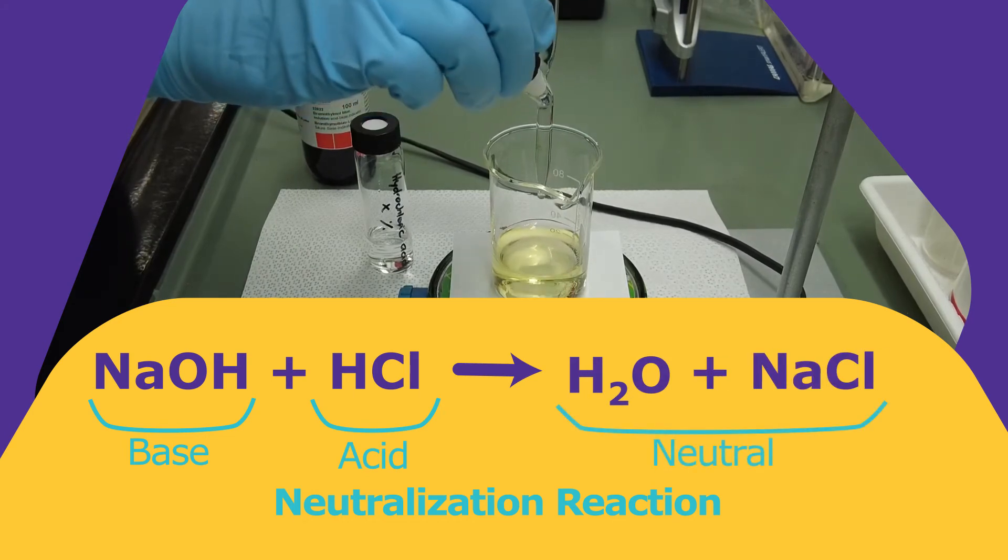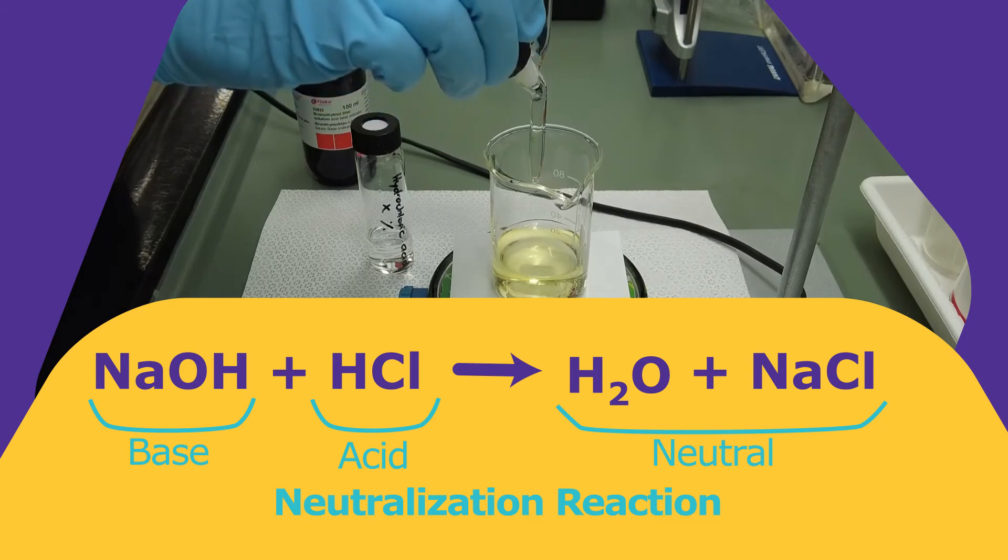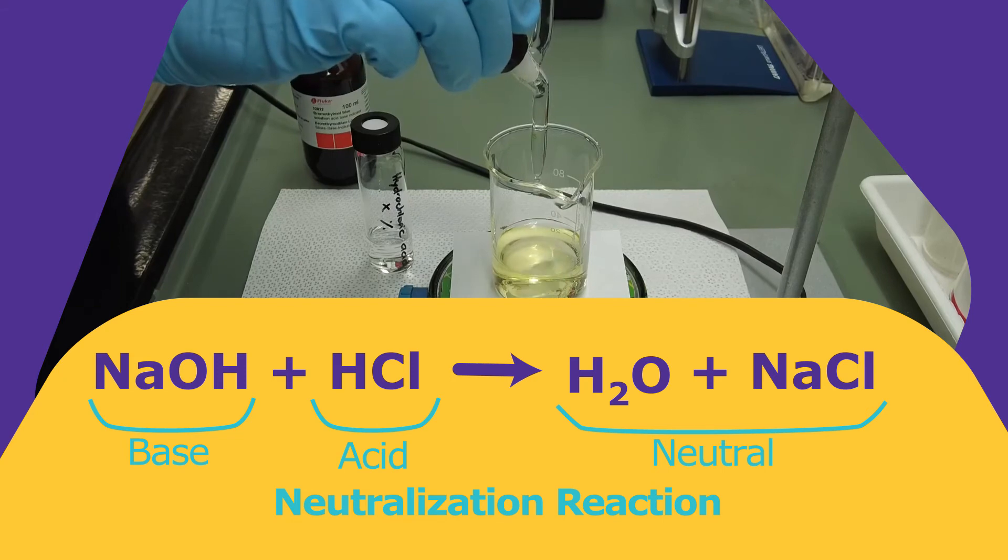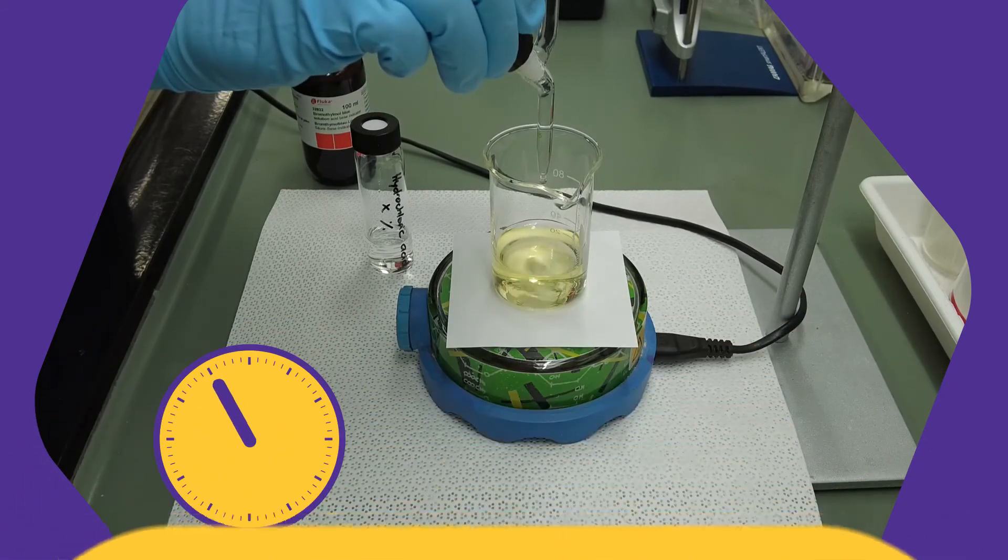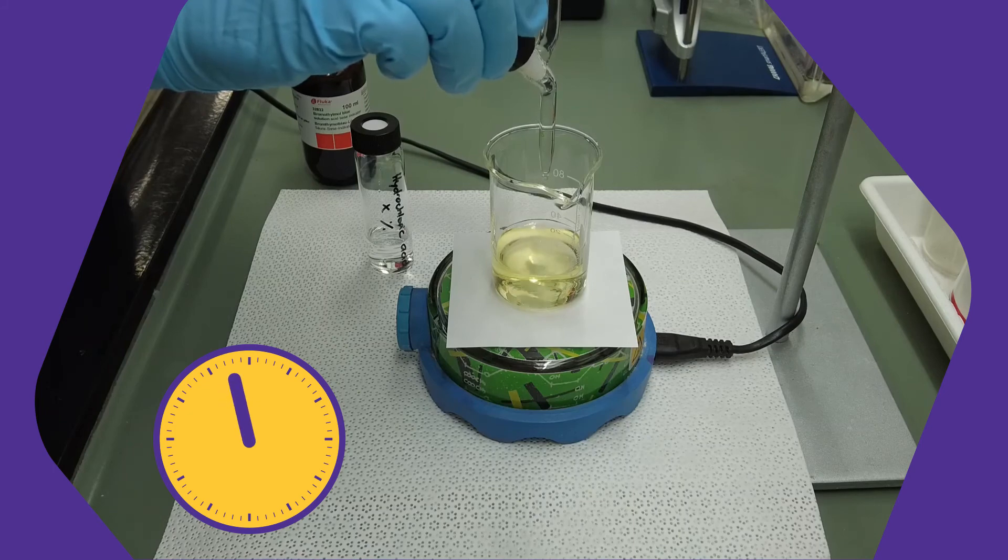We add the sodium hydroxide solution until the color changes. Then we have reached the equivalence point. We can read the used volume of the sodium hydroxide solution on the burette. In our example, 20 milliliters were required.